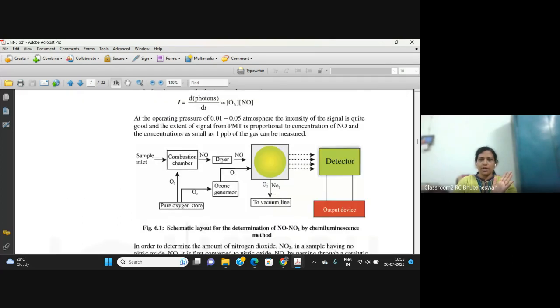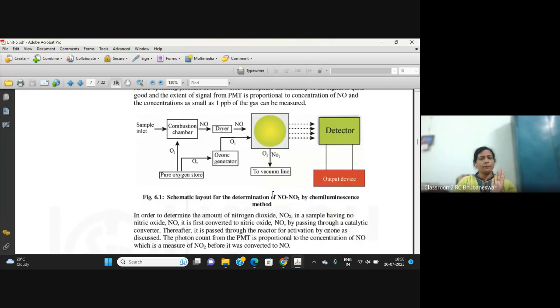So what is the mechanism? Everywhere you will have your sample compartment, which you have to design in your own way. If you want to study solution phase, I mostly study in solution phase, so my solution sample holder was there, but I also have the solid phase holder, and I can show you how the solid phase compartment looks.